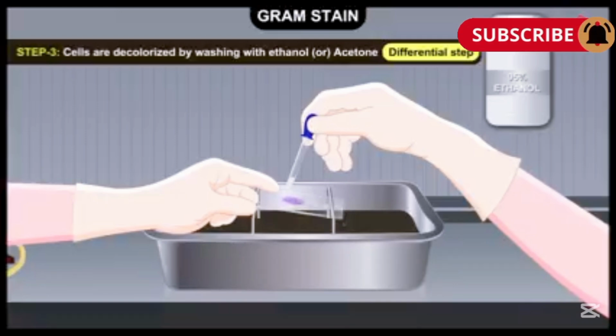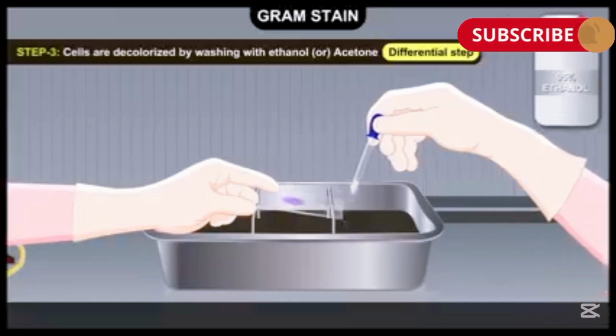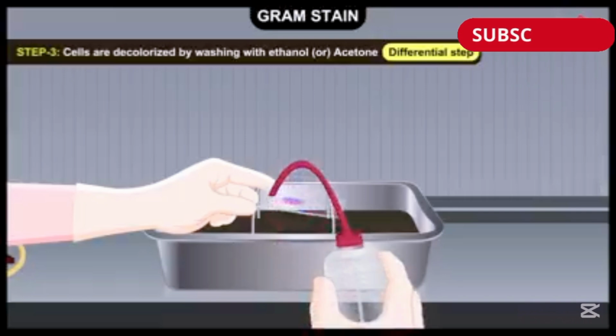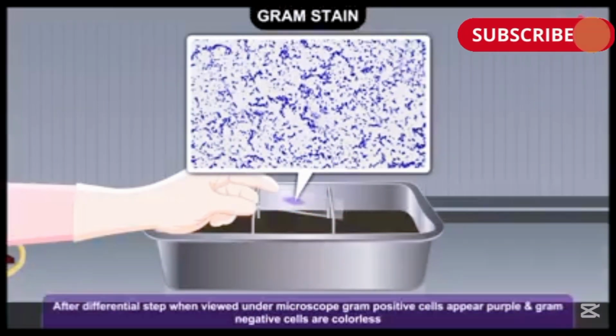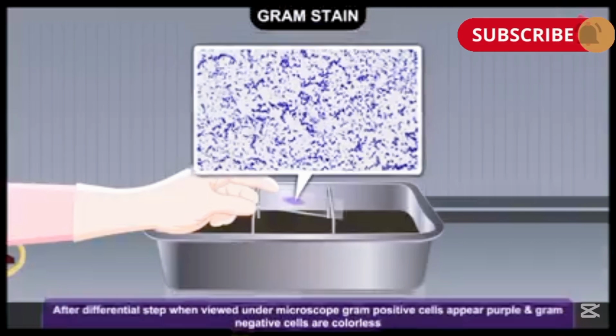Even gram-positive cells can lose the crystal violet-iodine complex during prolonged, excessive decolorization. Excess ethanol is then washed off with water. When viewed under the microscope, gram-positive cells appear purple, and gram-negative cells are colorless.